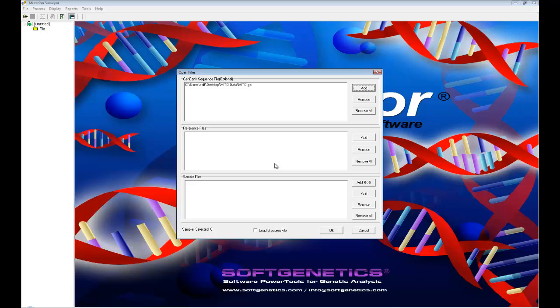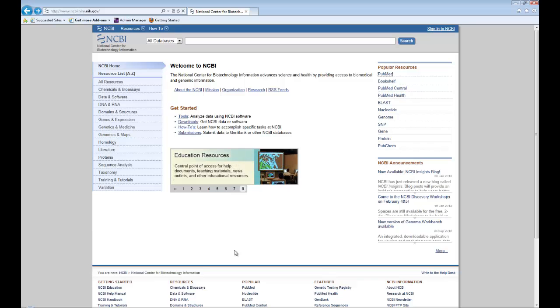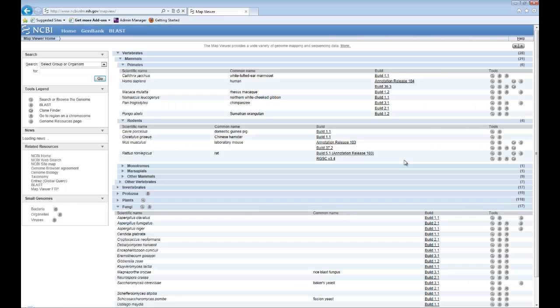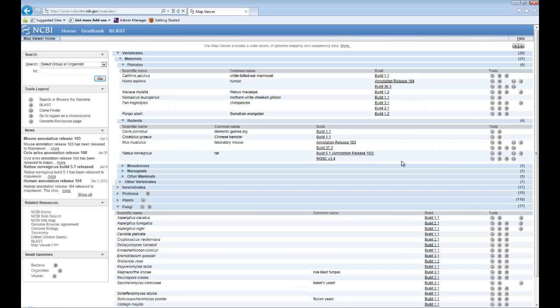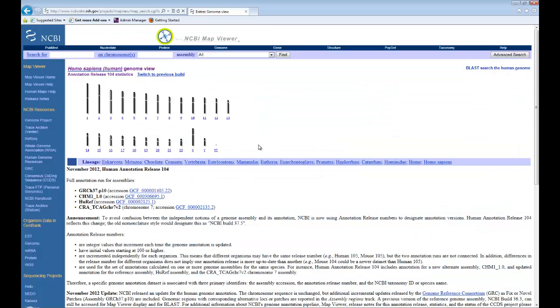To access the most recent mitochondrial GenBank file on the NCBI website, navigate to their home page. Select Genomes and Maps on the left of the page and then select Map Viewer on the right of the page. You can then select the most recent build for your particular organism. A list of chromosomes will appear and you can select the mitochondrial genome by selecting MT.